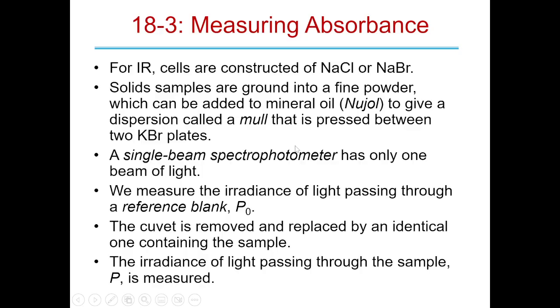There's a really funny story if you guys want to hear it sometime involving disappearing windows and people not understanding things. Let me ask you guys a question. All of these are salts, right? What do you think happens if you try to wash these windows with water? They'll dissolve, right? So there's a graduate student that washed those very high-end cesium salt plates, which were closer to $800 per window.